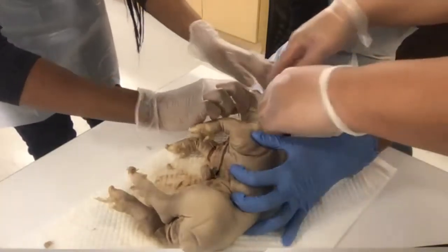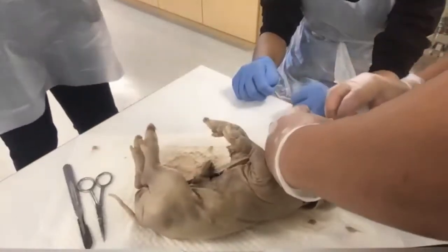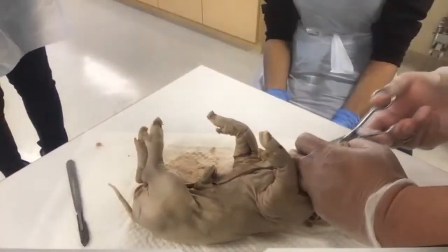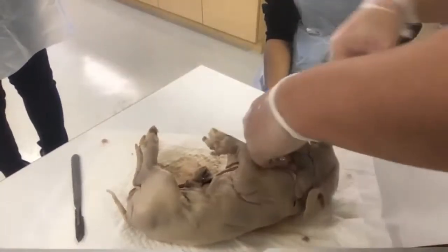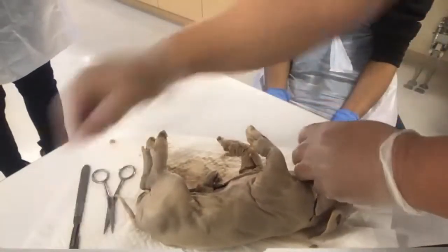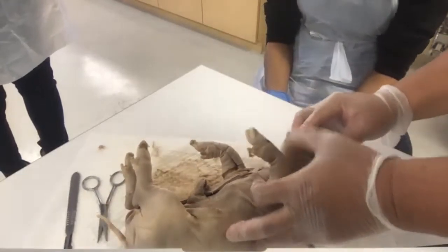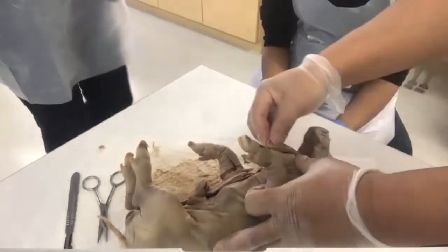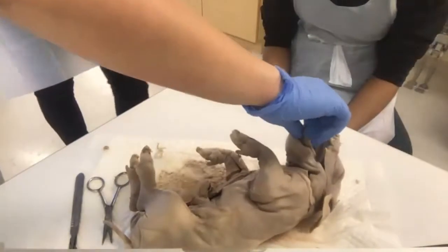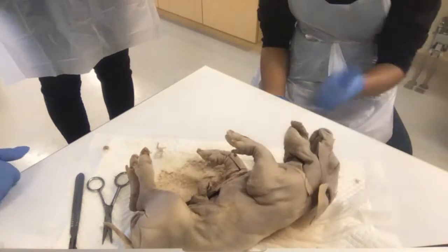So it's at this point in the show, right, we're gonna try to open this up. I can take a straight scissor. Open all of this up. Sorry, I'm being a little bit brutal. Oh yeah, okay. Now, let's all look at the tongue. Everyone feel it? And what does it feel like? Hard. Doesn't it feel like the heart? Mm-hmm. Right? Because it's a muscle, right?